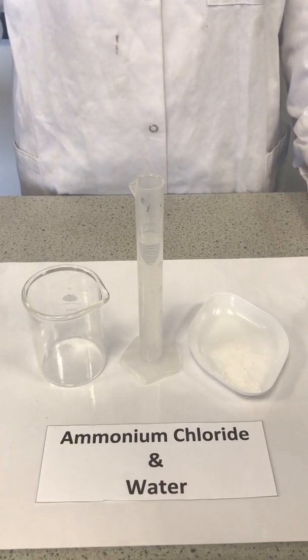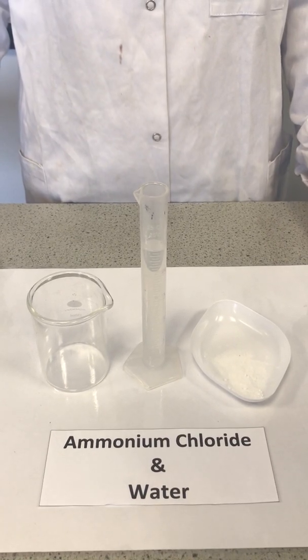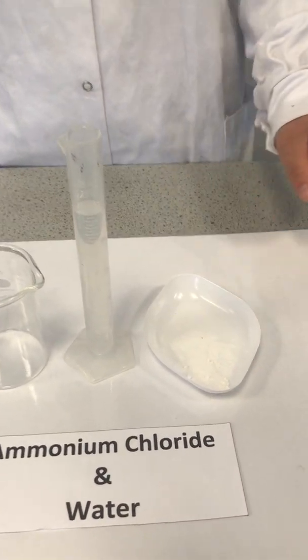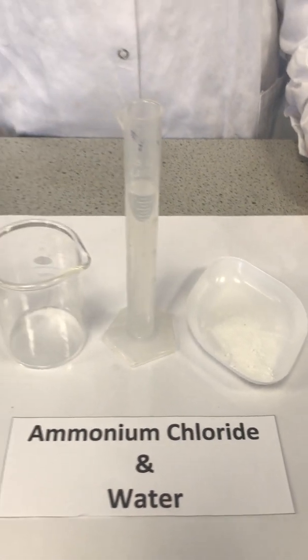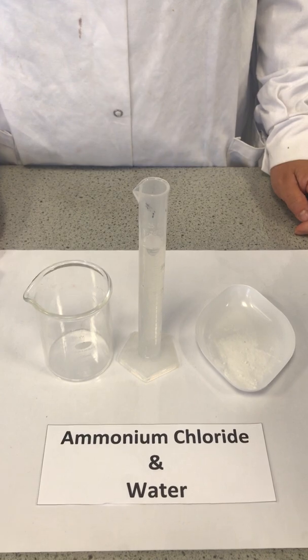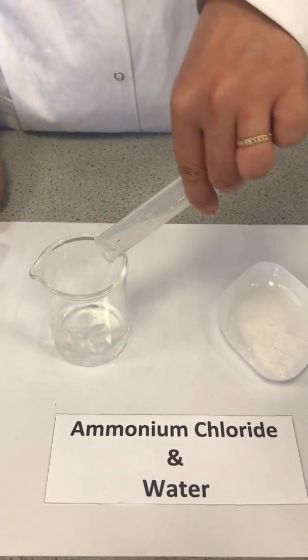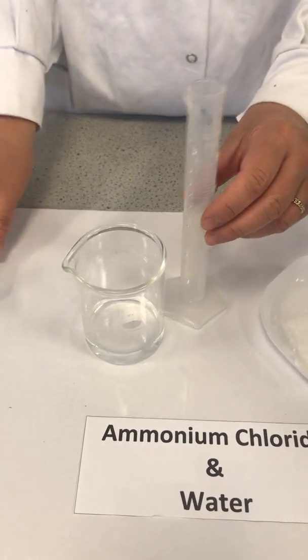The first reaction we are about to do is between ammonium chloride, which is a solid white powder, and water. Now we add water into the beaker and record the temperature.